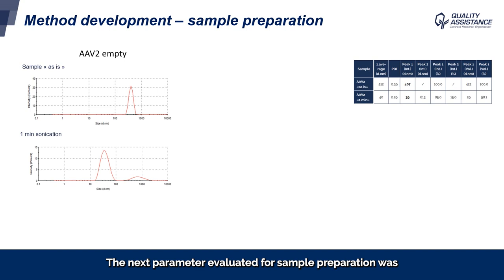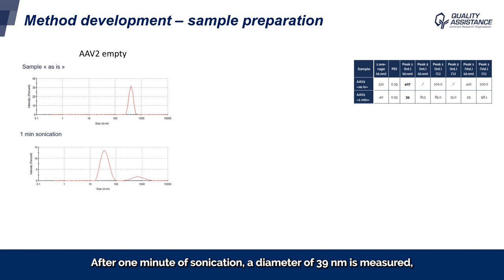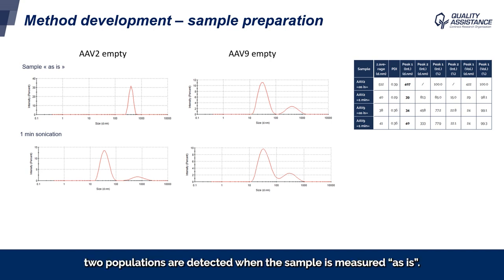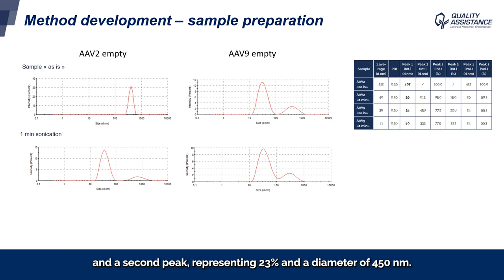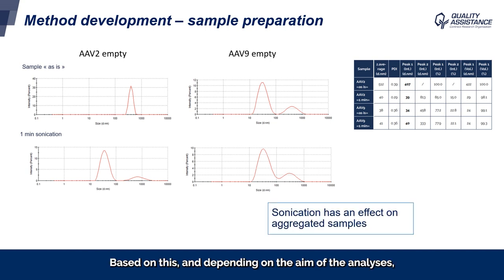The next parameter evaluated was the influence of sonication on the sample. For AAV2MT, a particle diameter of 400 nanometers was measured, indicating aggregation. After one minute of sonication, a diameter of 39 nanometers was measured — more or less the size of a monomeric AAV — indicating that aggregation was reversible. For the second sample, two populations are detected as is: a first peak representing 77% in intensity with a diameter of 34 nanometers, and a second peak representing 23% with a diameter of 450 nanometers. After one minute of sonication, the size distribution does not change, with the same percentage of each population and comparable particle sizes. Based on this, and depending on the aim of the analysis, the sonication step and its influence on the result should be assessed.